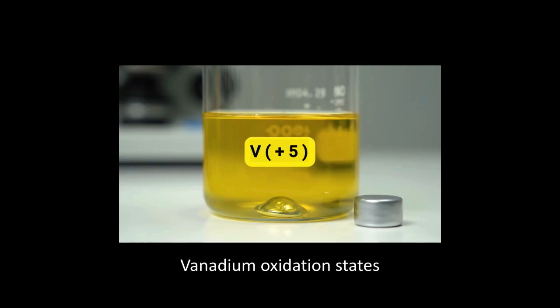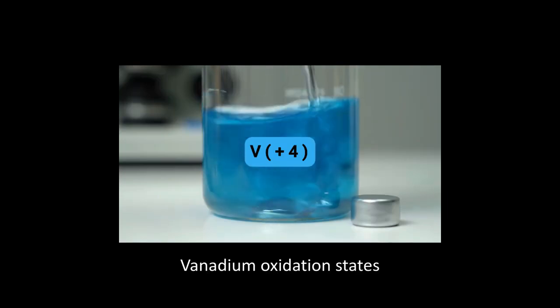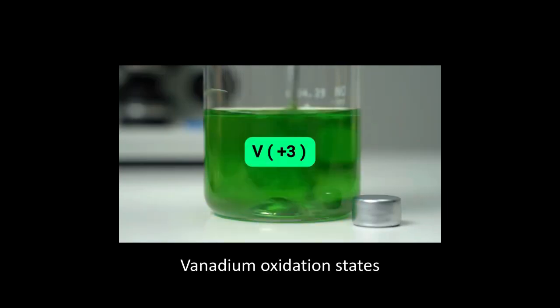So what I have out here is an aqueous solution of vanadium in the +5 oxidation state, and if I stir this solution in the presence of zinc mercury amalgam, the color of the solution is actually going to keep changing. So what's going on out here?